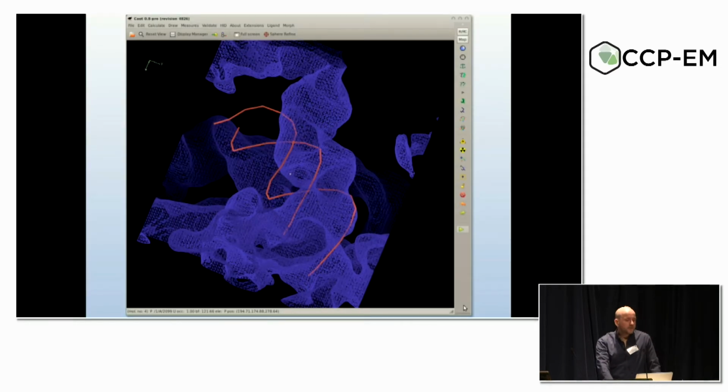The idea is that we have a structure, a model. In this case, it's a piece of RNA, so it's easy to see where it should go. In the general case, it's rather less clear where a model should go. You are somewhere close to where you want to be, within a few angstroms. It does a rotation-translation search and places it in the density.